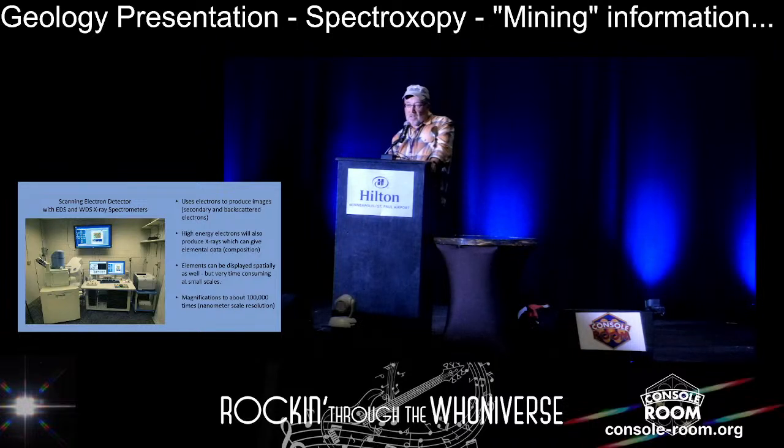The magnification goes close to 300,000, but we can't get things in focus at 300,000. Basically, we're on the first floor, which is effectively the third floor because there are 2 layers below us. But the vibrations within the building preclude us from getting higher resolution. We can still see things that are a few nanometers across. But the stuff where you see atomic-scale things that they can do today is astounding.